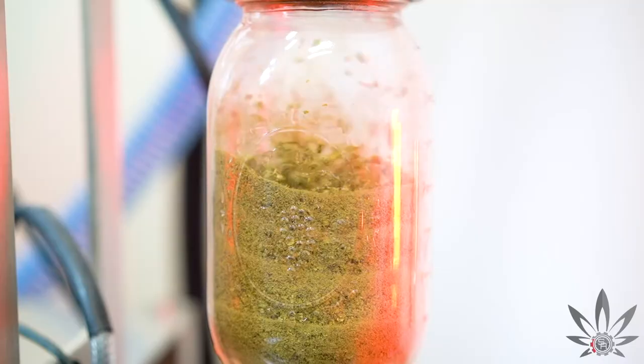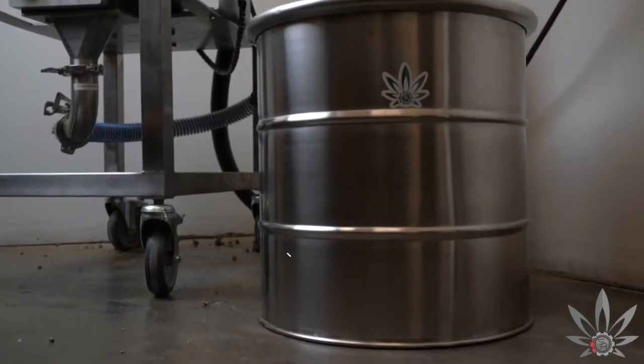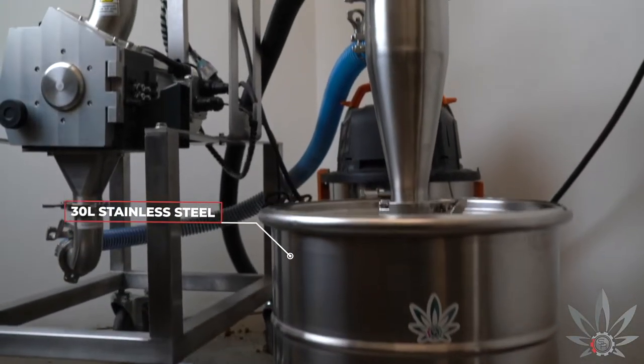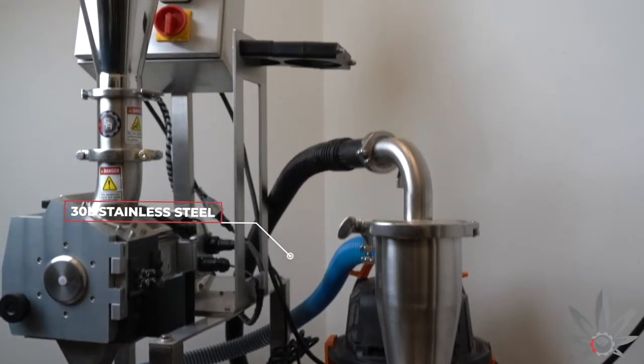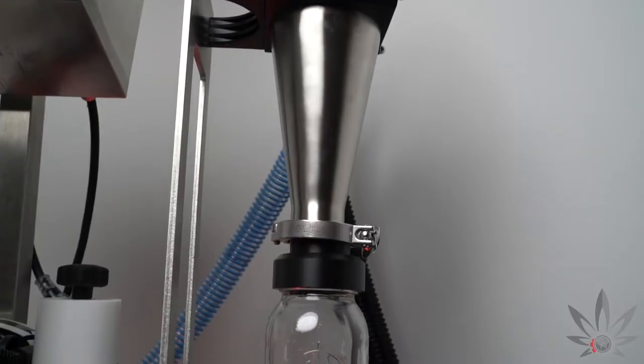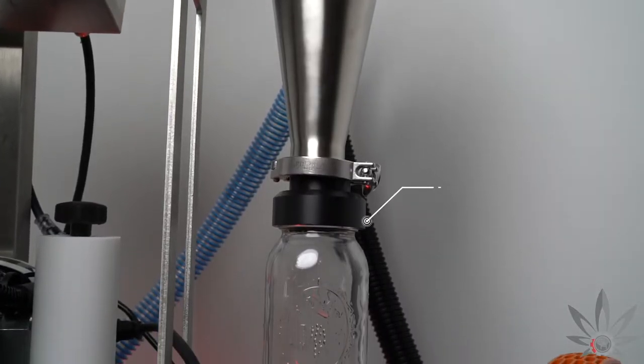Once it has passed through the cyclone, you can choose to collect the milled product in larger containers, such as this 30-liter stainless steel container, or in smaller containers like these classic ball jars, depending on your output needs.